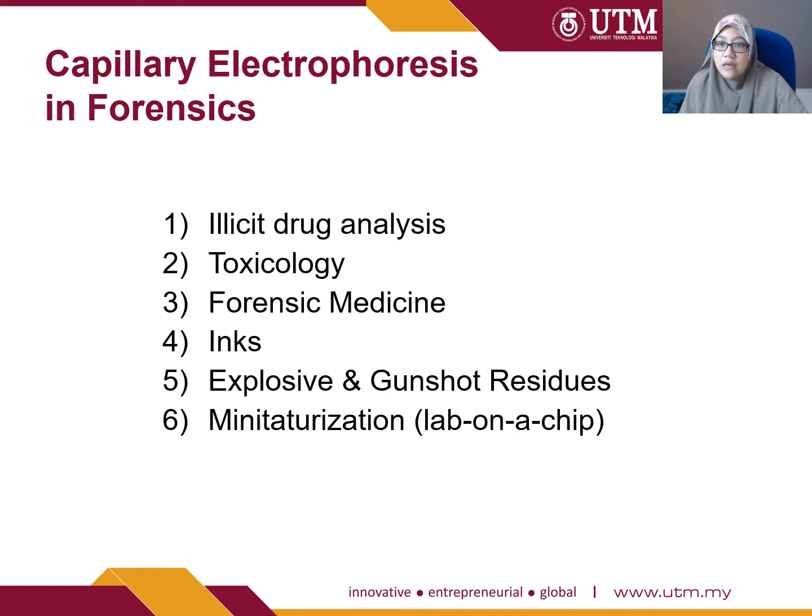And in explosives and gunshot residues, forensics is very particular, whereby a wide range of analytical techniques is used. As you know, they also use other techniques like HPLC, GC, SEM, TEM, and others.